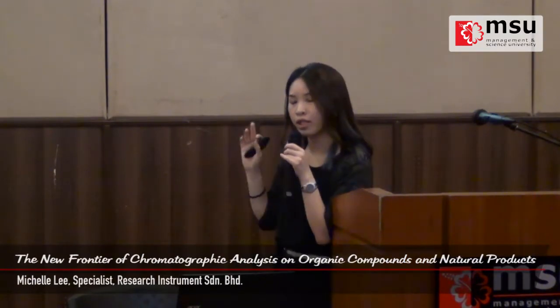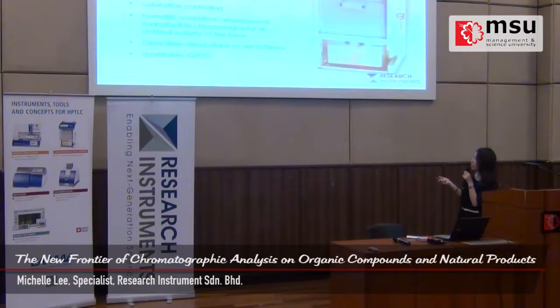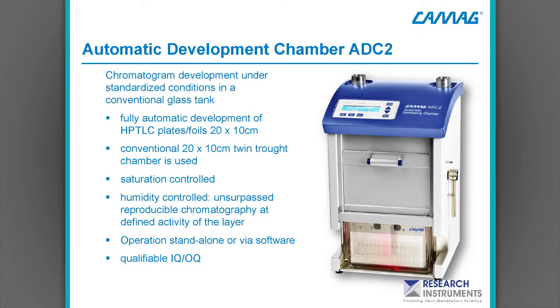So these are the three kinds of possible conditions, but there is actually no wrong or right, because different conditions are going to give you different results, different separations. So it's actually very dependent on the method. Okay, so this is our ADC2.